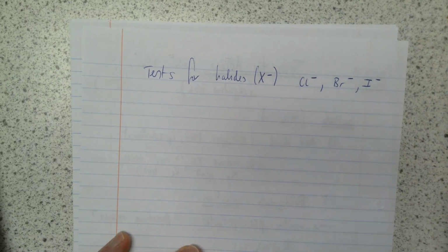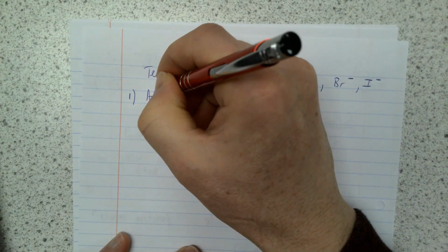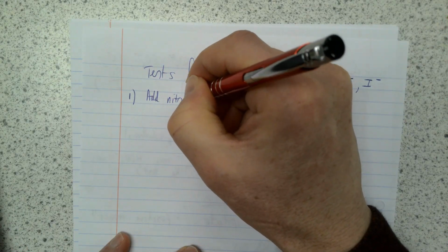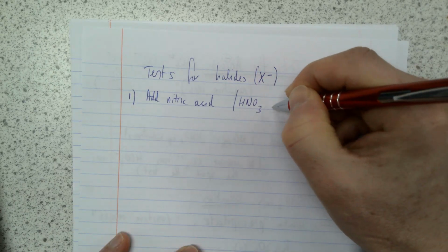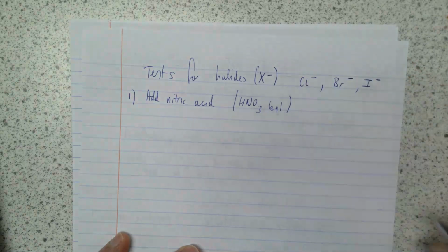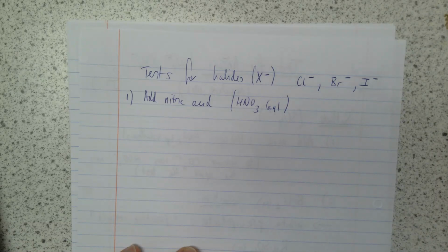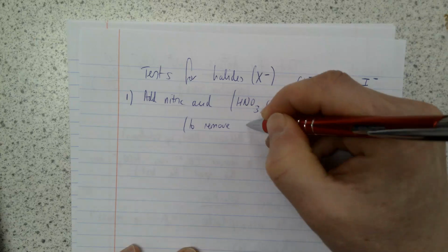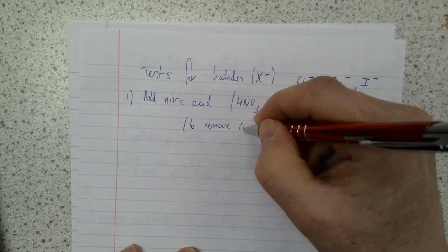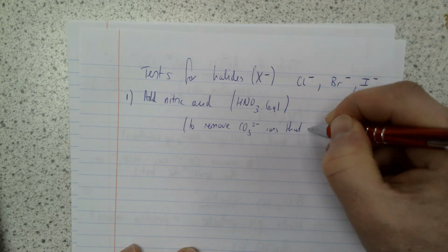Now, what we would do for that chemical test is first add nitric acid, HNO3, in solution, and that again, just like before, was to remove any ions that spoil the test. It's to prepare the test to work properly, to remove ions, carbonate particularly, that spoil the test.